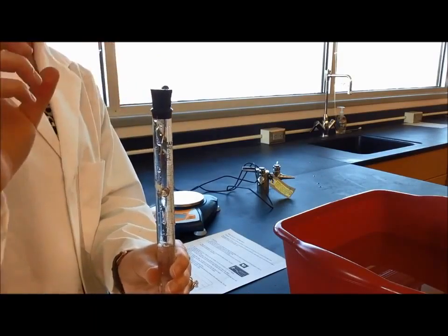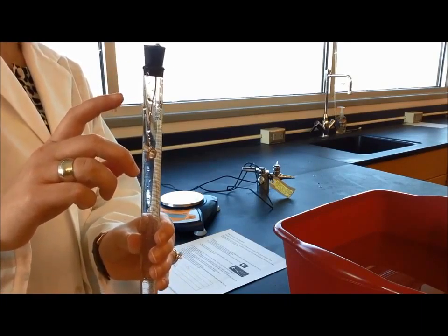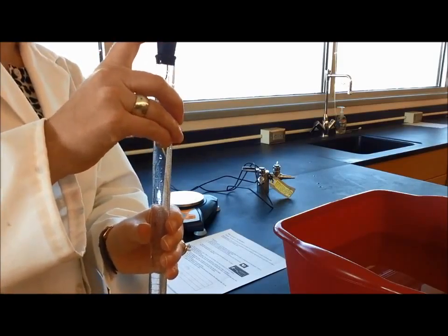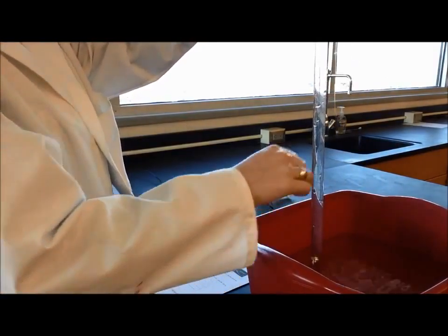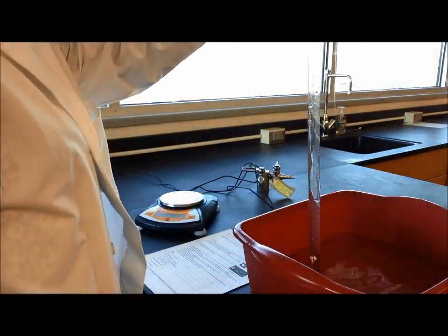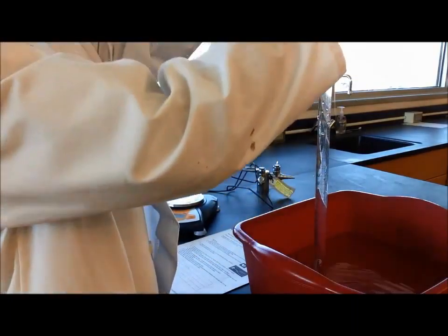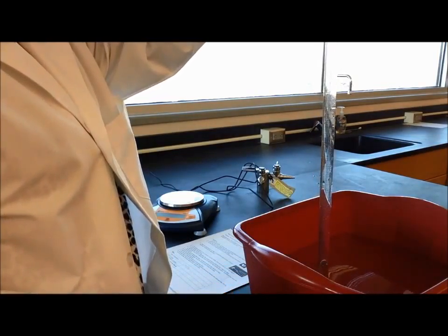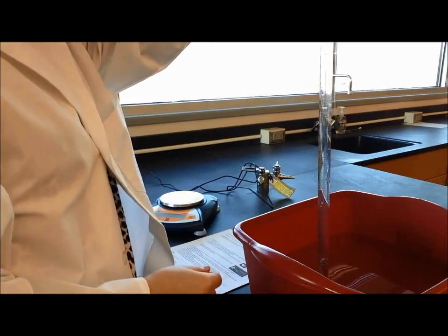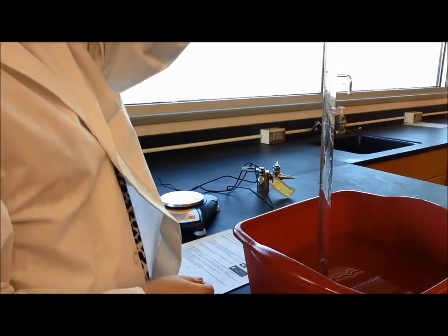My stopper has a hole in the bottom where the copper wire goes through. Step eight says place your finger over the hole in the stopper and invert the burette in a large bucket of water — the end should be below the water level. So I'm going to put my finger over the stopper and in one motion flip the whole thing upside down into the bucket. Step nine says since hydrochloric acid is more dense than water, it will take a minute for the reaction to begin — the acid will move down the burette and eventually hit the piece of magnesium metal.